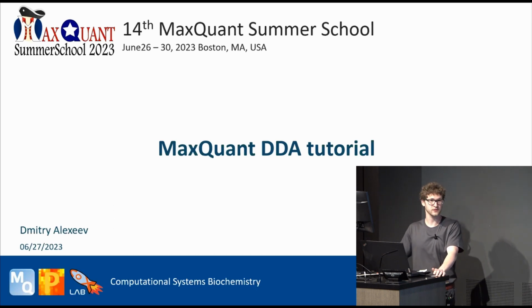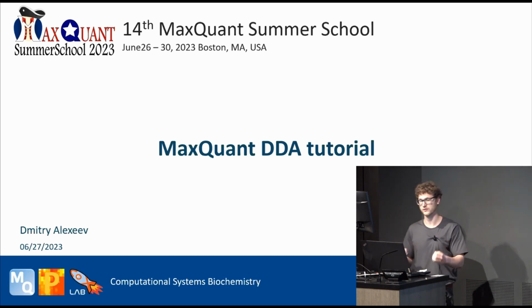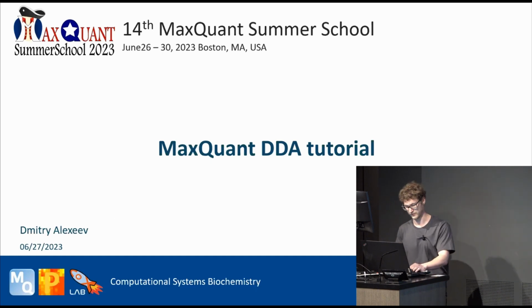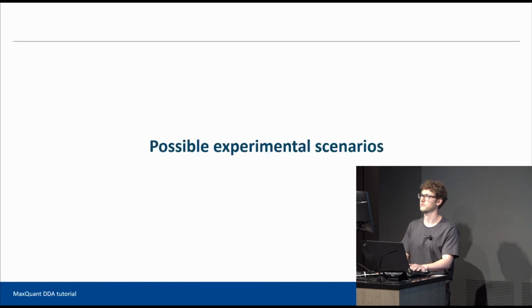Also ask me questions on the go, but note that you can ask technical questions like where to find this or that parameter. For example, if you didn't catch something that I was talking about, you can ask during coffee, lunch breaks, and during Q&A sessions. So from that, I will move on to experimental scenarios.